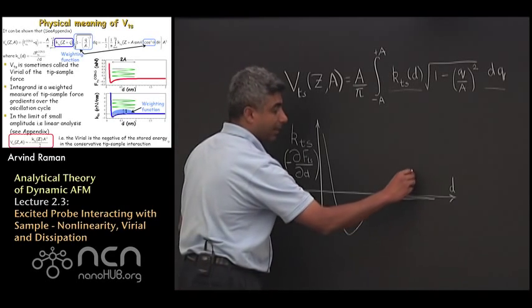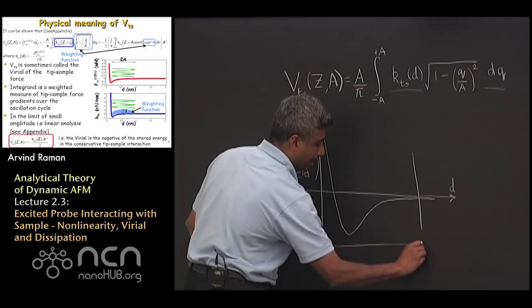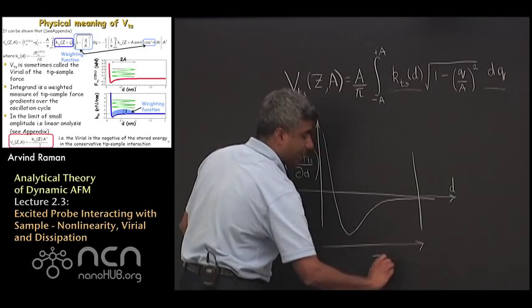Now, let us say that the cantilever is located at a position z from the sample.